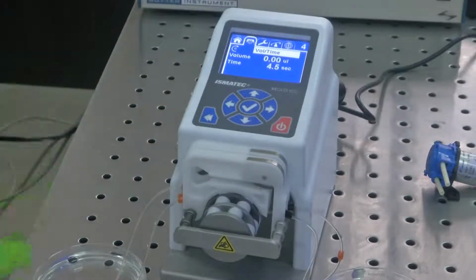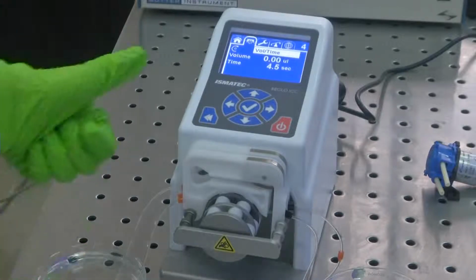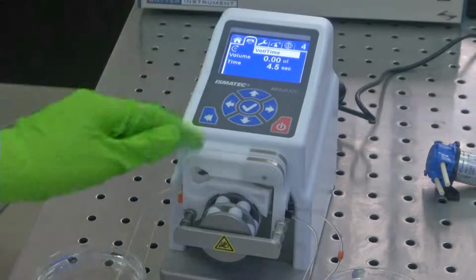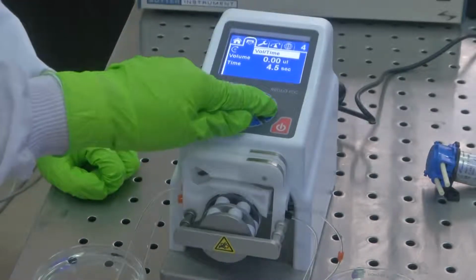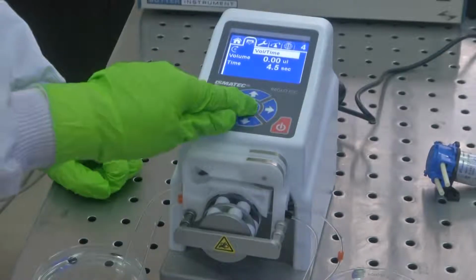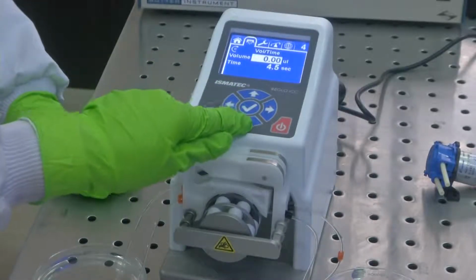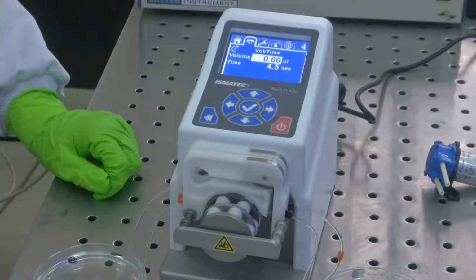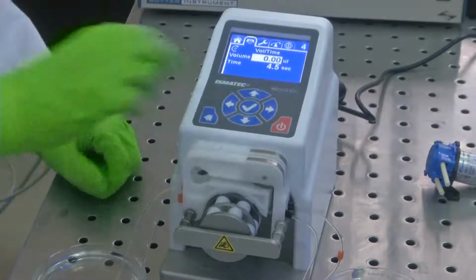Now as you can see, for cassette 4, we are now in volume. You can even change it. So let's say we do the volume per time settings. Let's say we will drive around 2 microliter of fluid.